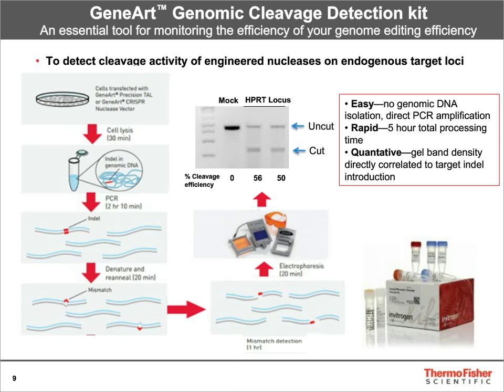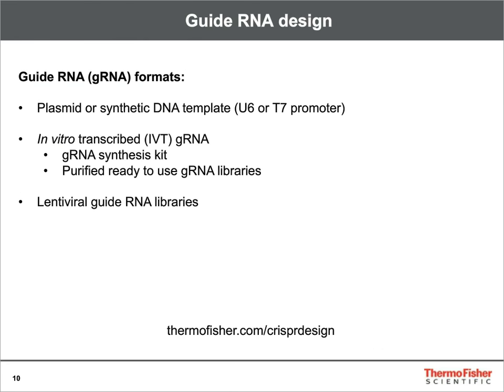So I've walked you through the Cas9 technology and the assay systems that we use to measure the cleavage efficiencies once the cells are edited with the CRISPR-Cas9. Now let's look at how to design the target-specific guide RNA. The different guide RNA formats that one can use.